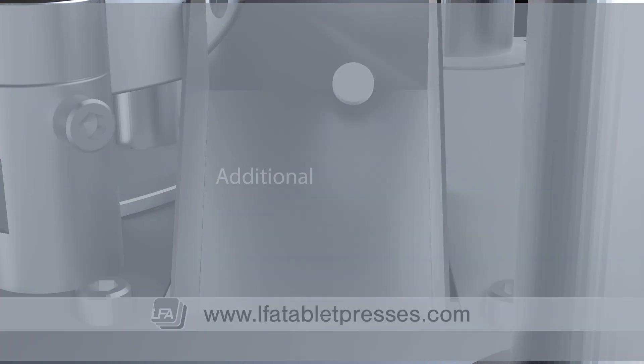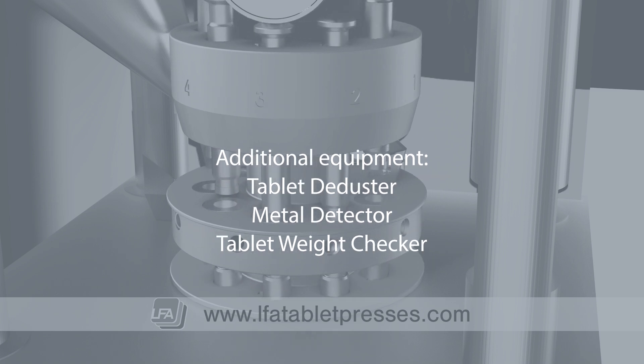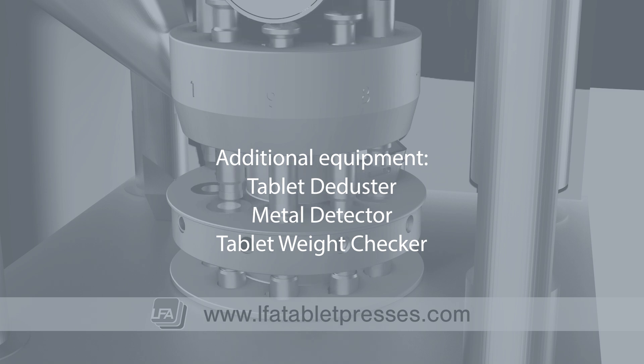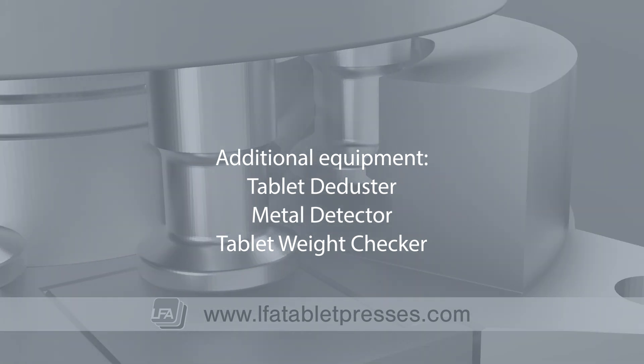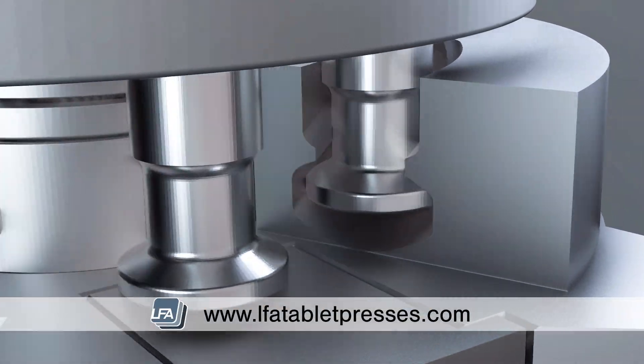Additional equipment may be used alongside a tablet press, such as a tablet deduster to dedust your tablets, a metal detector to detect metal inside the tablet, or a tablet weight checker to ensure your tablets are staying a consistent weight. For more information, products and guides, please visit www.lfatabletpresses.com.